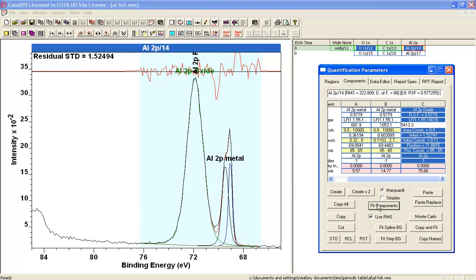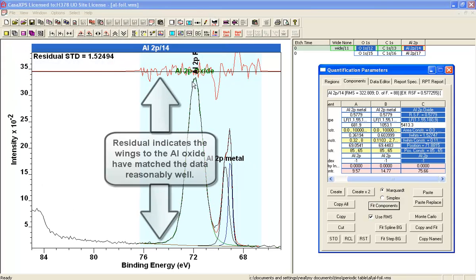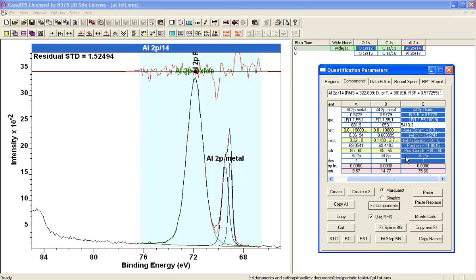And then say fit again, and now I've got a new fit here, and you can see now that the oxide is starting to pick the data quite nicely. So that adjustment to the peak shape has worked quite well.